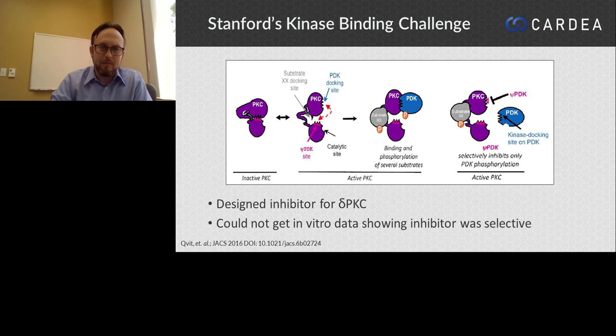Typically, you might use a label to do this type of measurement, but that requires development of a label and addition of more reagents and a movement away from what's really happening in the biology to an abstraction of what's happening with the label. Doing a direct measurement of whether or not his peptide bound to this kinase is what he wanted to do. So about a month after the conference, I traveled to Stanford and spent an afternoon working with Nir trying to get the data.